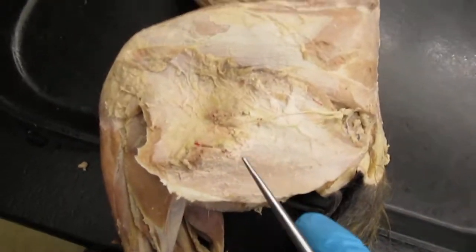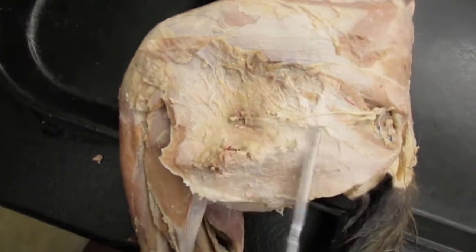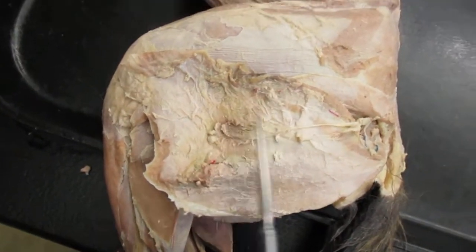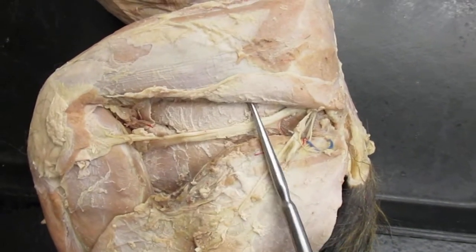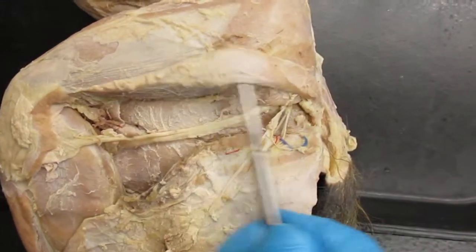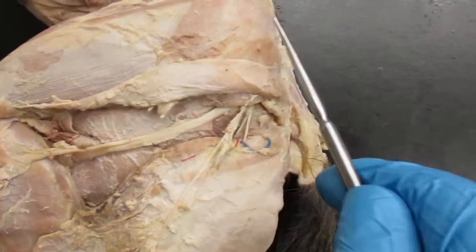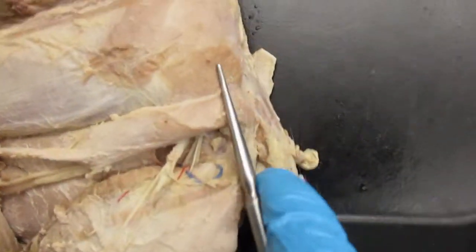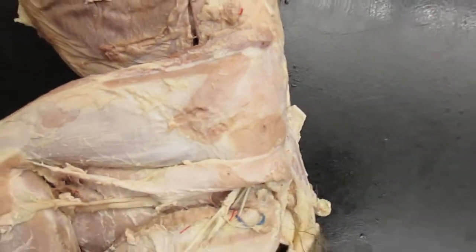So let me go over this one more time here. So we have the biceps femoris again, right there. We have a muscle that's cat specific called the caudal femoralis right here. So this is the caudal femoralis right here.